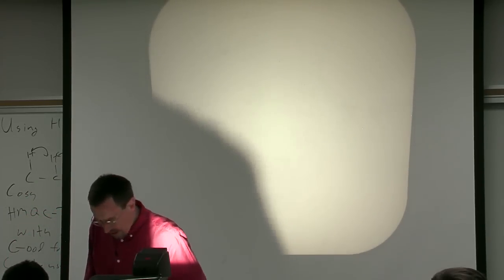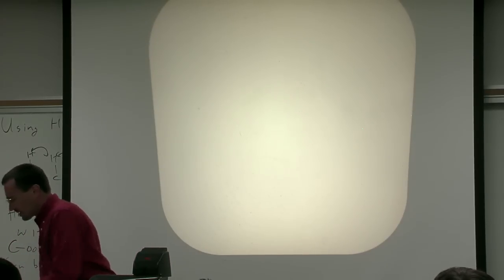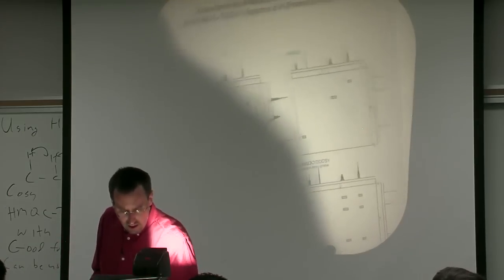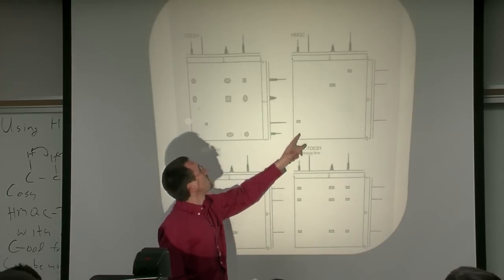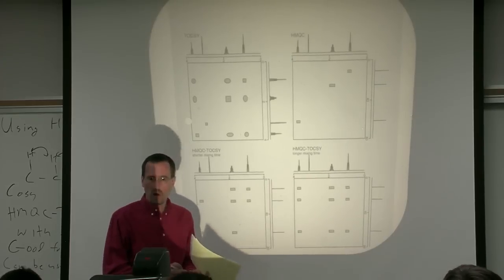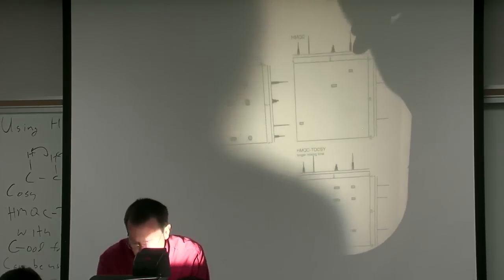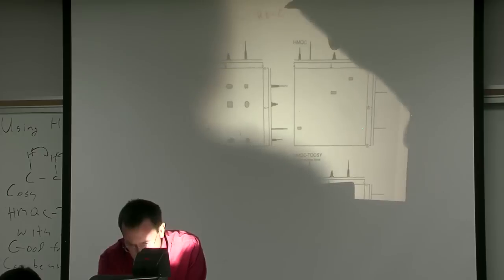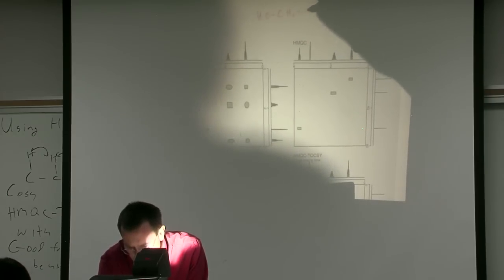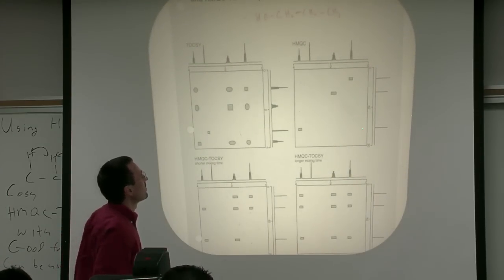So at this point, I want to come back to this issue of TOCSY and HSQC-TOCSY, HMQC-TOCSY. All right, so just to review here, this is the cartoon spectrum I gave you of propanol for HMQC and the cartoon spectrum I gave you of propanol for TOCSY, right? So this is one propanol, so it's HOCH2CH2CH3. And obviously this is trivial, but it's a schematic.